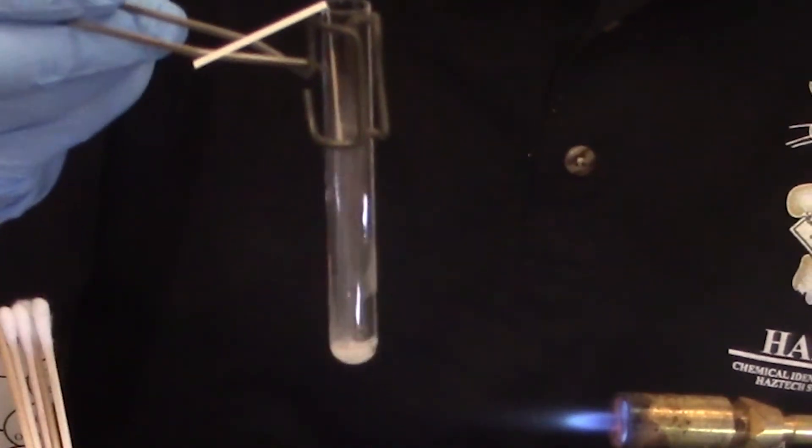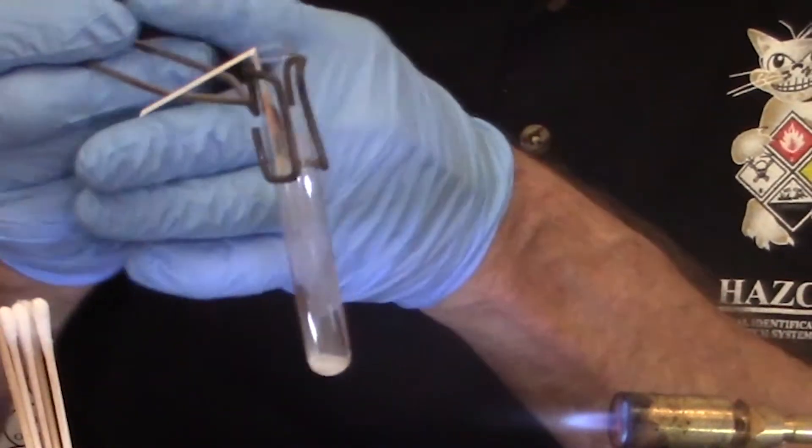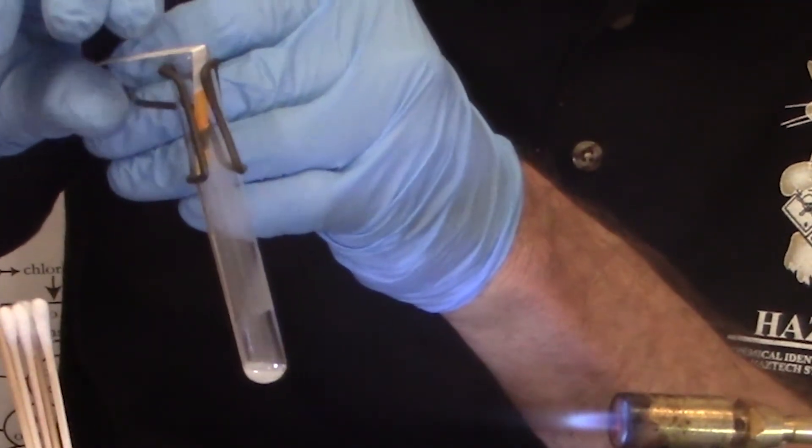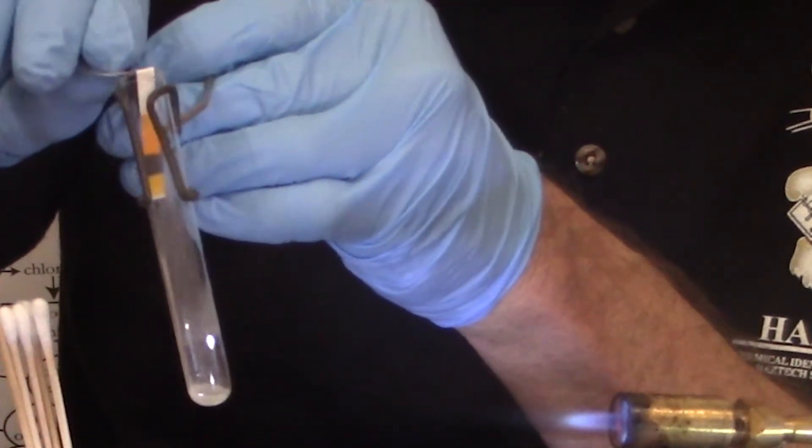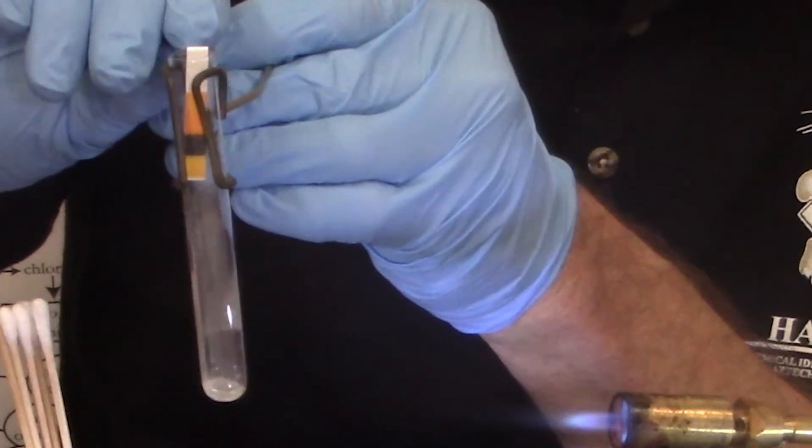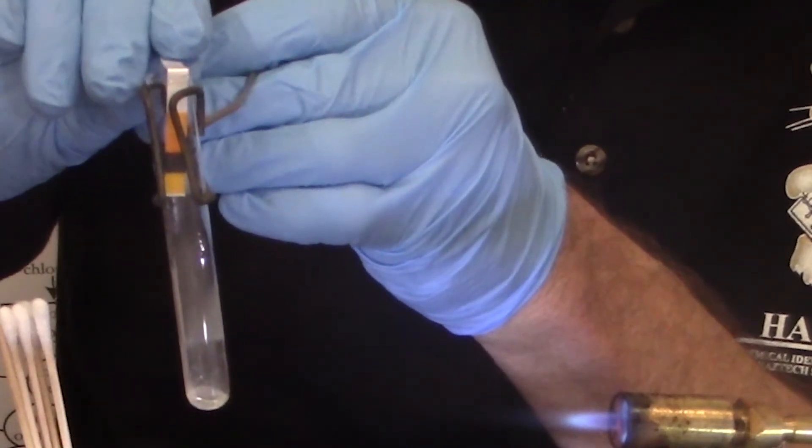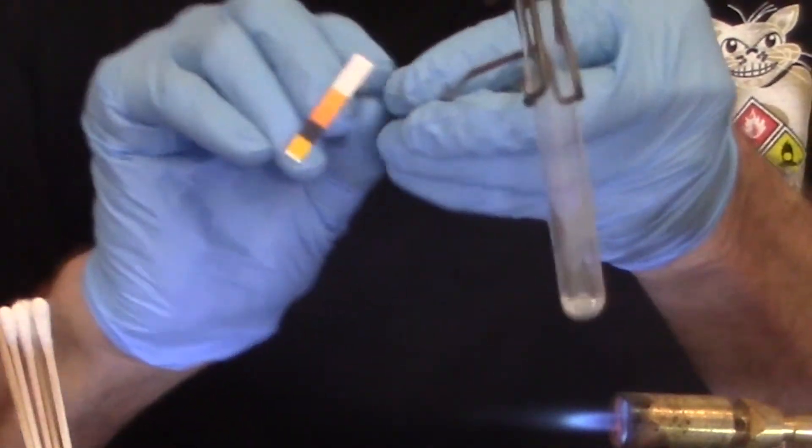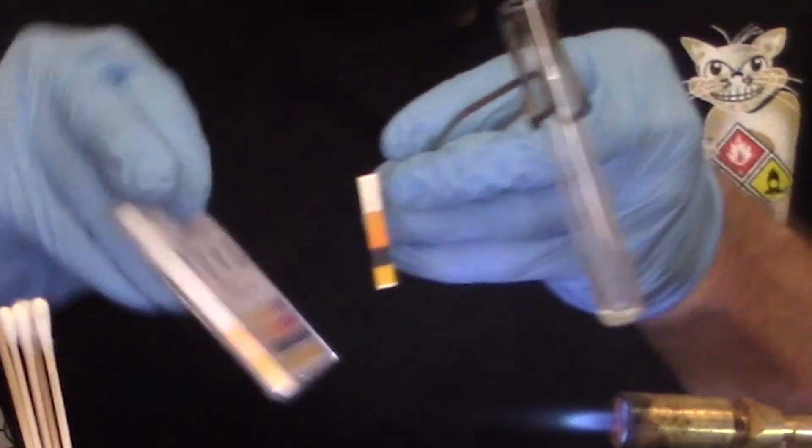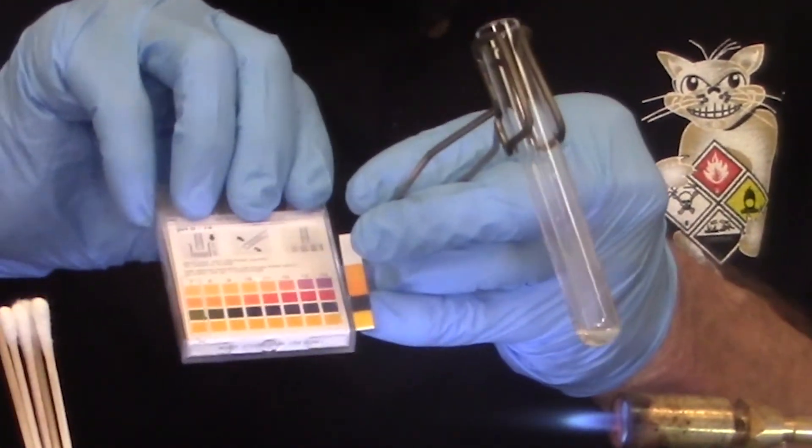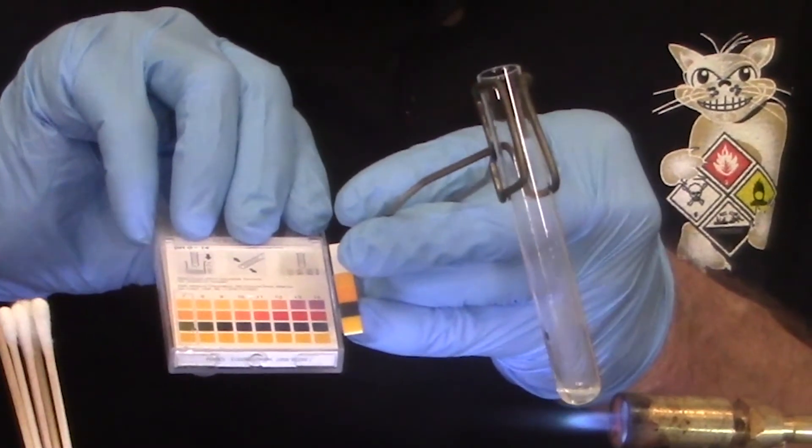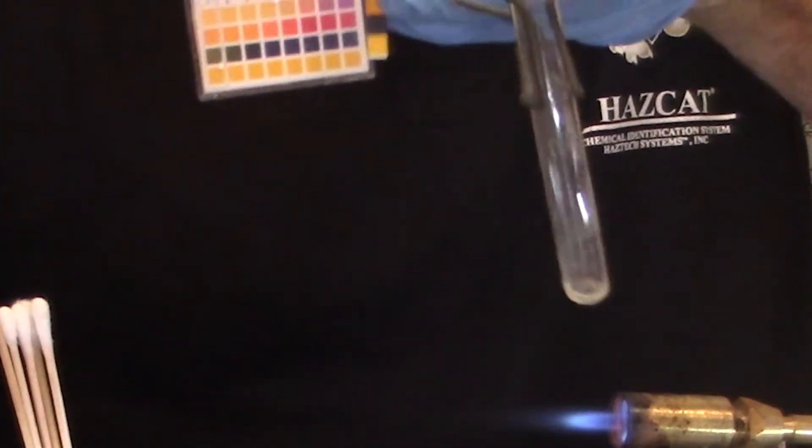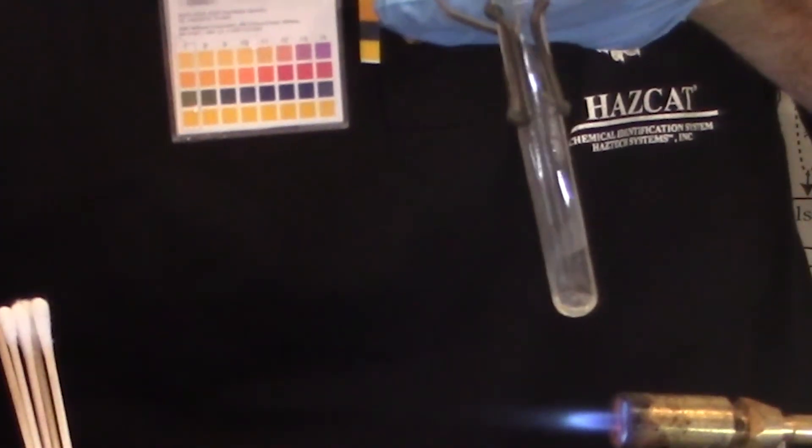Just pull the pH paper out of the heat and let it sit in the vapors for that 10 seconds. I don't know if you can see it, but the pH paper did change. That second square got quite dark and I got a pH of about a 9 or 10, about a 9 or 10 on there.